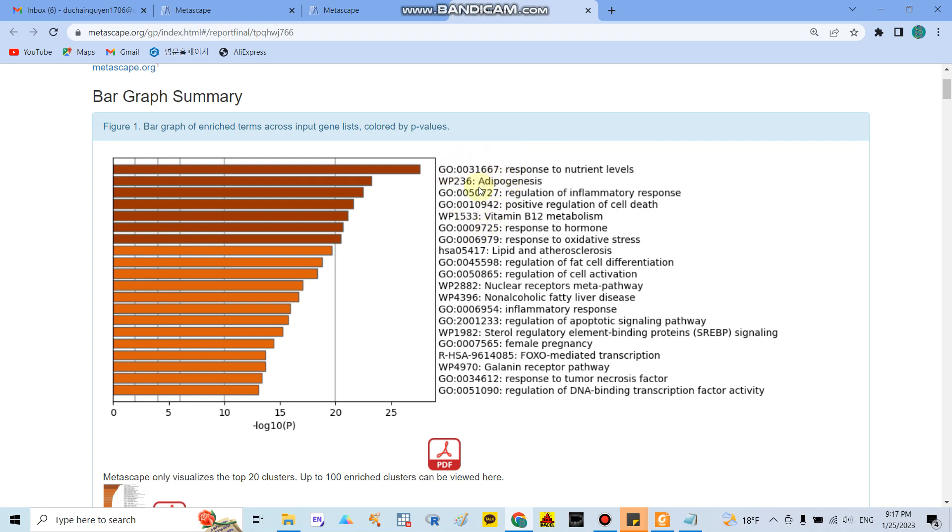They said that the GO term responds to nutrient levels, adipogenesis, or regulation of inflammatory response related to obesity and curcumin.